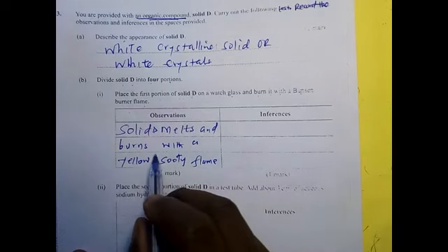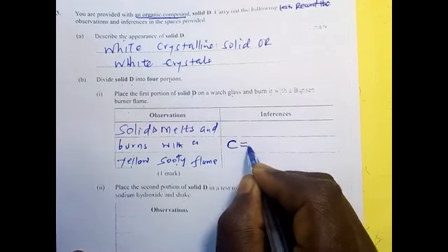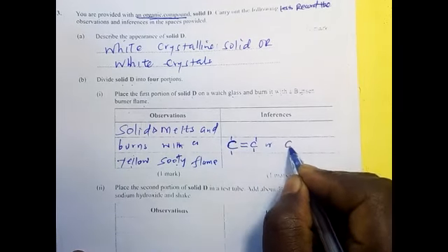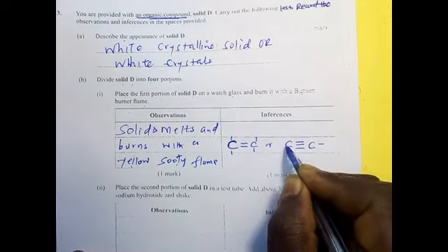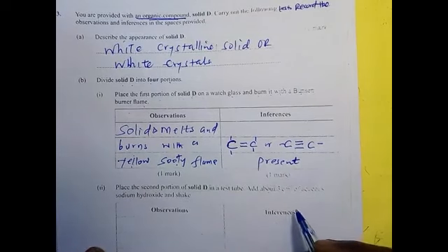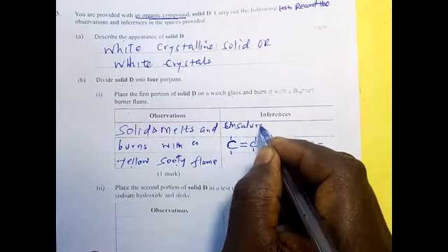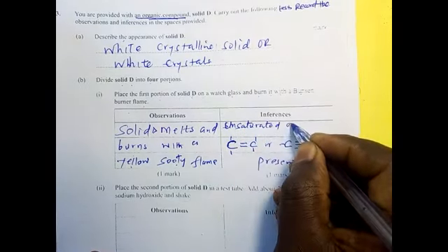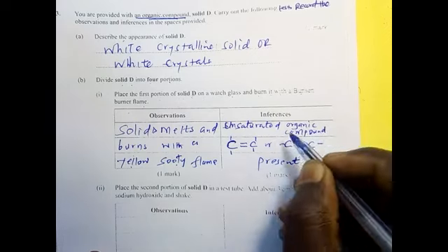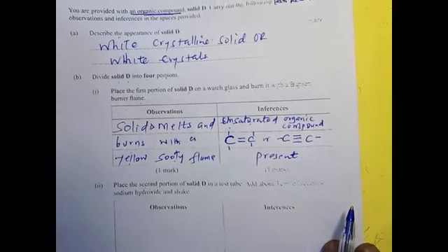If it burns like this with a sooty yellow flame, then that tells you it is unsaturated, the double bond or the triple bond present. It is acceptable to say unsaturated organic compound present.